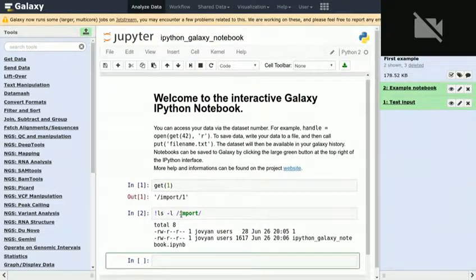So if you click this save button here, it's more or less saved internally. If you do an ls -l on this dataset again, you will see that the time has changed. Okay, so this is the get function. We can even look at the file.